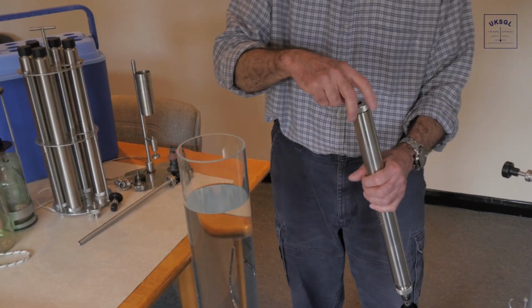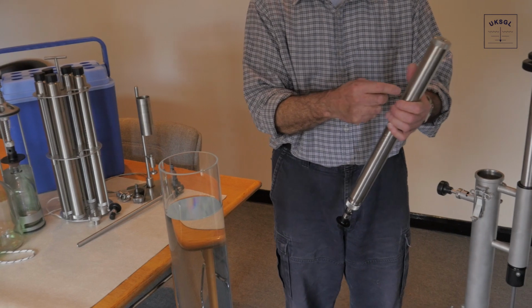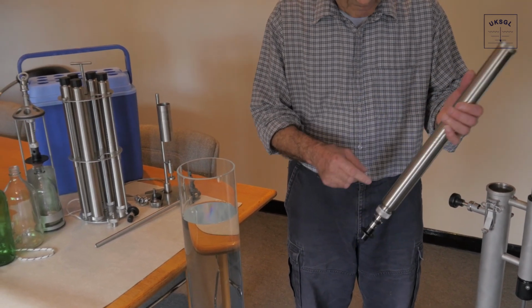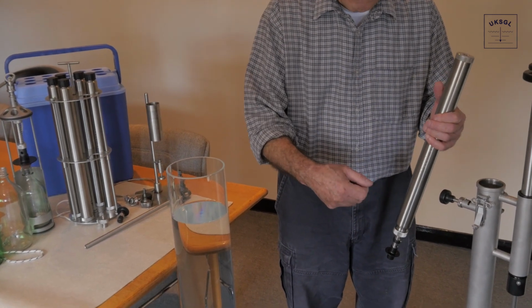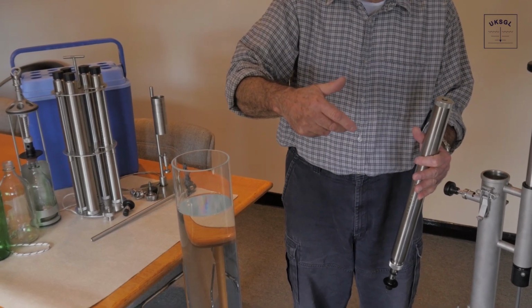To ensure this happens, the sampler is lowered at a rate commensurate with the depth of the tank. So, for a shallow tank, the winder handle should be turned slower than for a deeper tank, the aim being to have the sampler at 80% capacity just as it reaches the base of the tank.